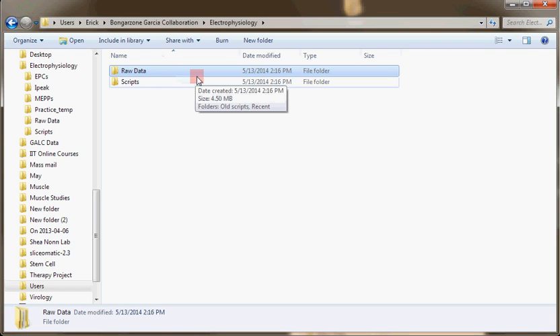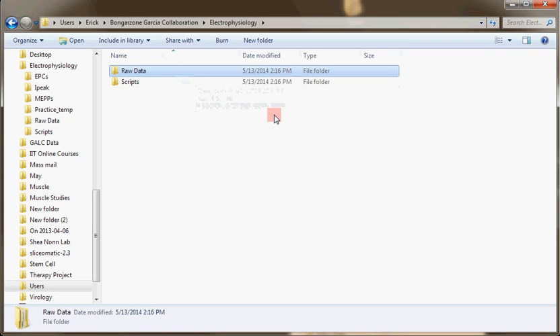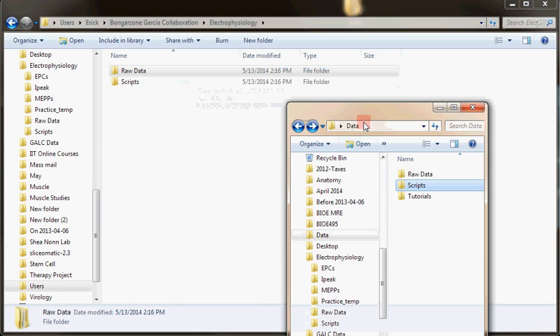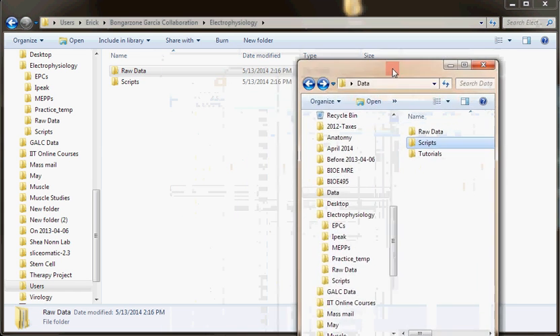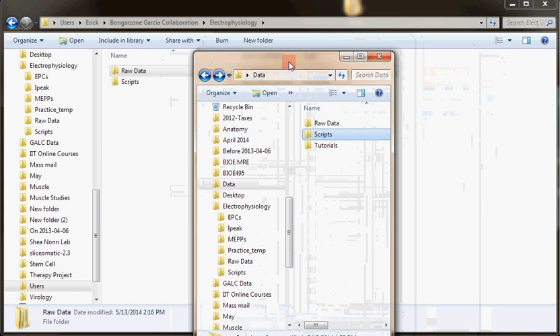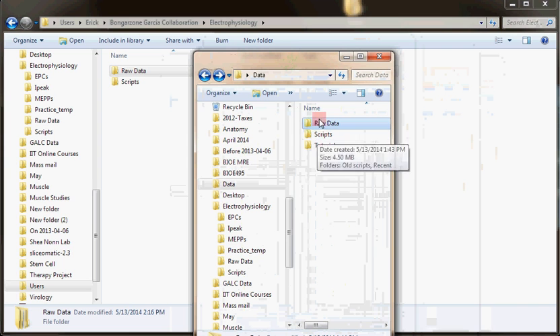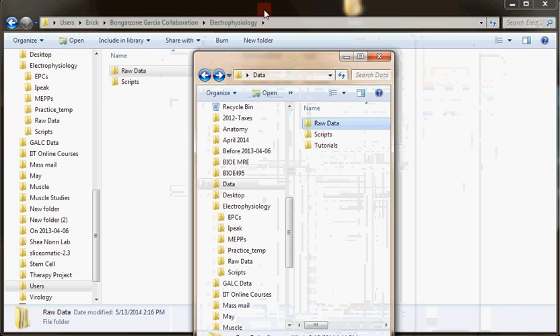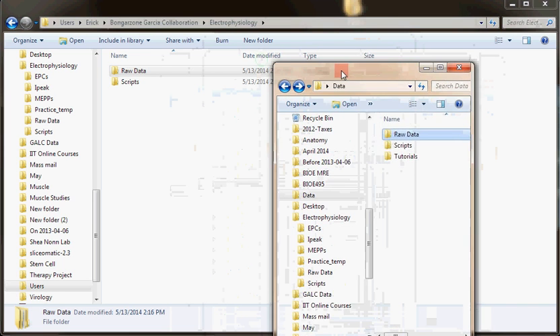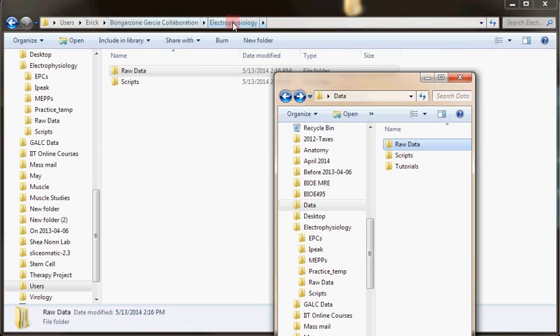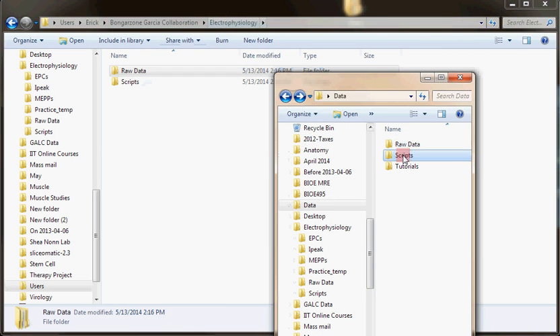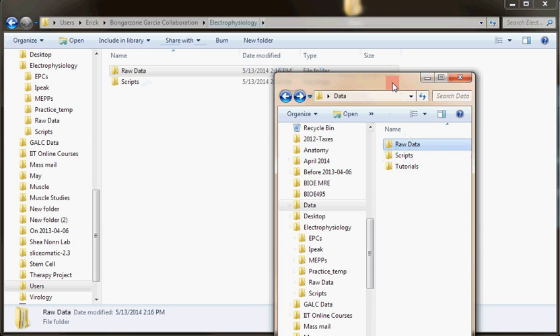I'm going to go over how to analyze the ABF files that we analyzed in this study. I'm going to look for the raw data in our data and transfer it to my desktop. I already transferred it to my folder here, and I transferred the raw data. I'm also going to transfer the scripts folder, so these two folders will need to be transferred.